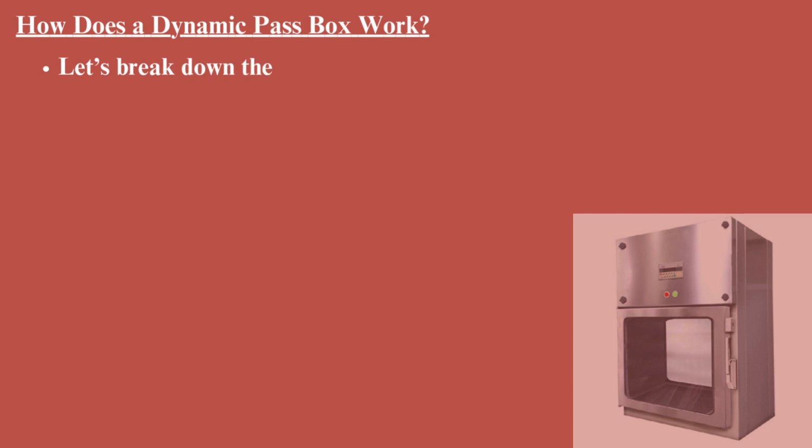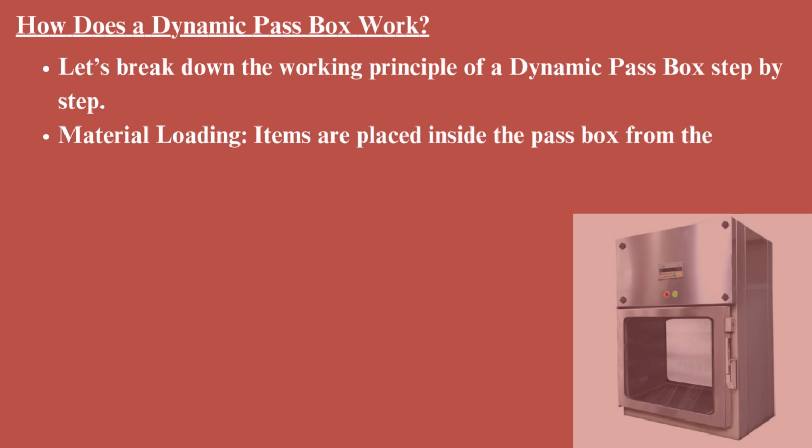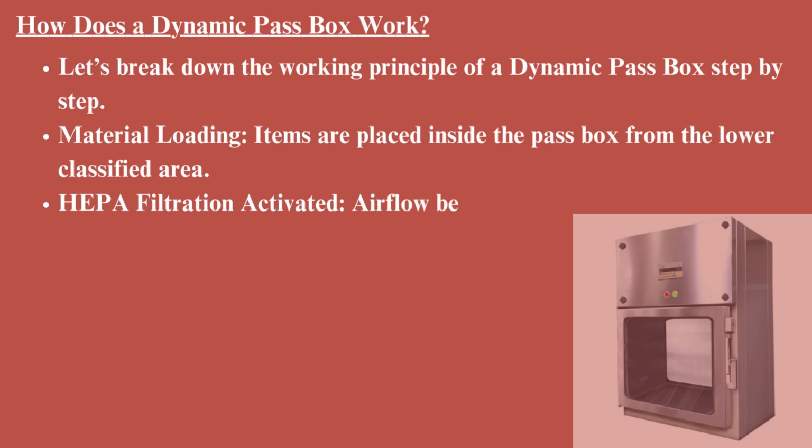How does a dynamic passbox work? Let's break down the working principle of a dynamic passbox step by step. Material loading. Items are placed inside the pass box from the lower classified area. HEPA filtration activated. Airflow begins, filtering out contaminants.